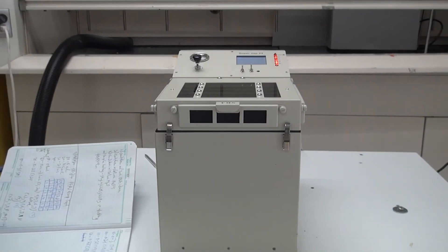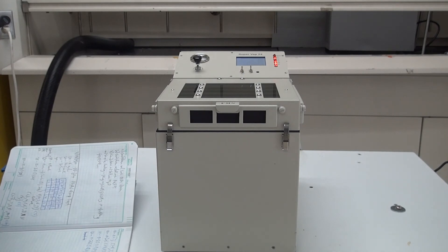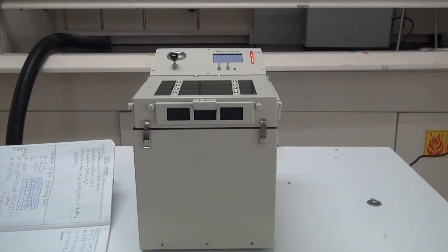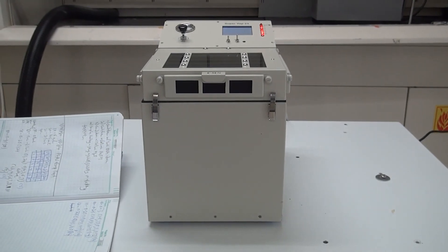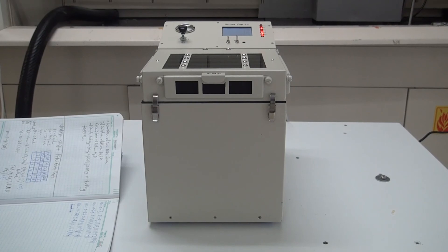So as you can see it's got a very small format, it does a large volume of basically a batch of PFAS extracts in 70 minutes. So pretty fast, pretty efficient, it's unattended, it can run outside of the hood, it's got a very small footprint and it's inexpensive. So if you have any questions please contact us for any further information, thank you.